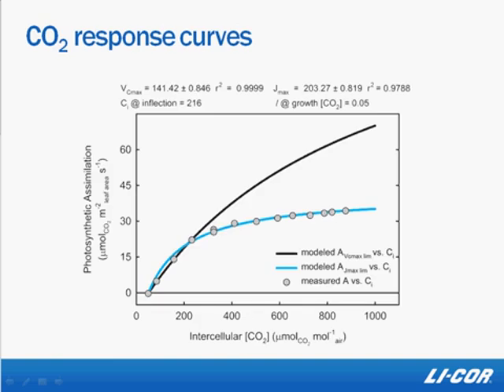So let's move on to CO2 response curves. Just like light response curves are the plant's response to changing light levels, CO2 response curves measure the plant's behavior when CO2 levels are changed.